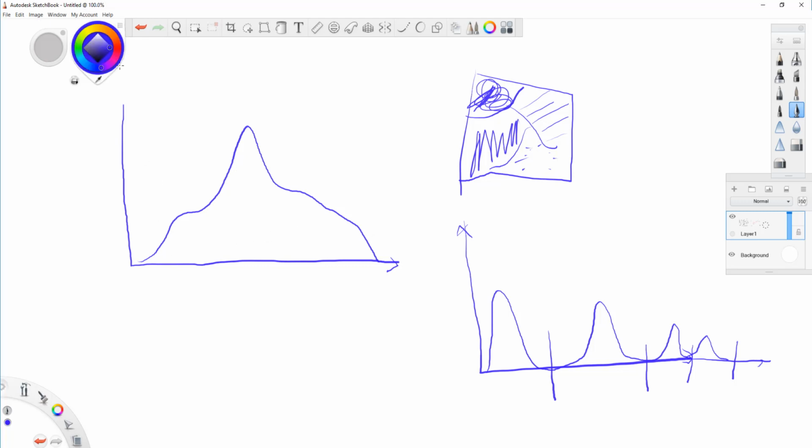Well, one way of doing that, let me switch the color, one way of doing that is k-means. You can try to separate this into four clusters, but Gaussian mixture model actually assumes Gaussians, that this entire histogram, this entire region, is made up of a whole bunch of Gaussians. Let's say there is one right here, maybe one right here, and another one right here. All I'm trying to say is that this histogram in blue is nothing but a combination of four individual Gaussians that are mixed at different ratios.